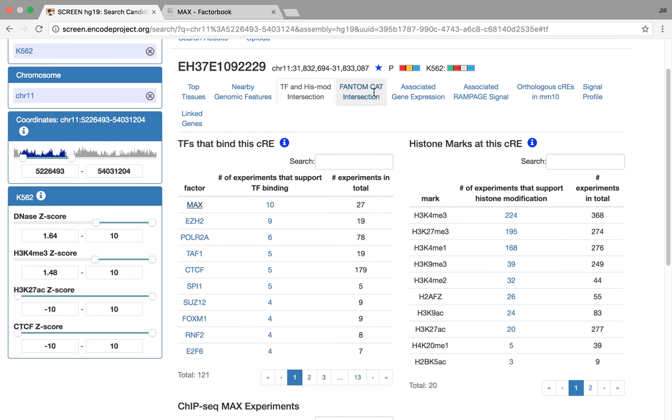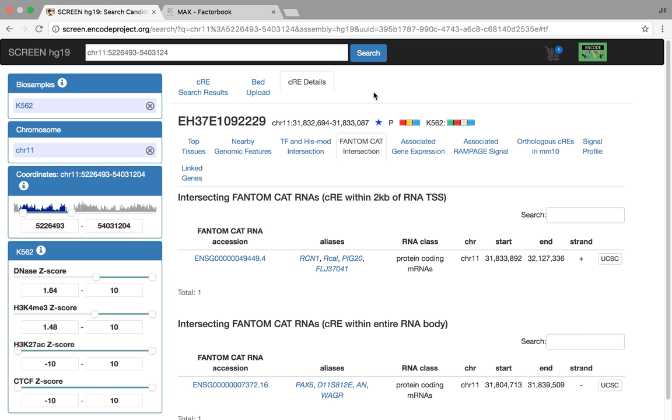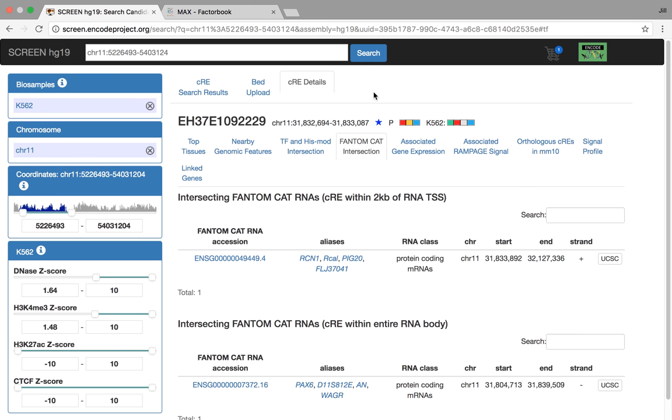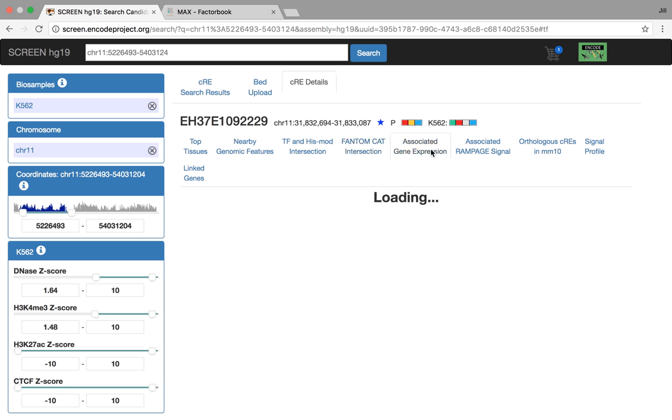Alright, back to SCREEN. Next tab, we've also intersected the CREs with the FANTOM5 CAGE transcriptome data, and you might be interested in this if you're interested in lincRNAs. We've also taken all of the RNA-seq data from ENCODE project and are displaying it here for the gene nearest the CRE, in this case.